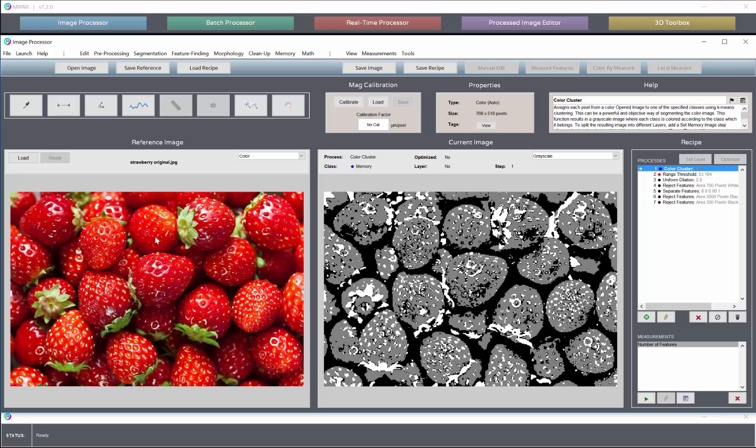Sometimes three or four different colors in the image. And the color cluster can be very useful to automatically and objectively partition that image into as many classes as you're after, with then subsequent steps being used to sort cells by size, shape, and other attributes.